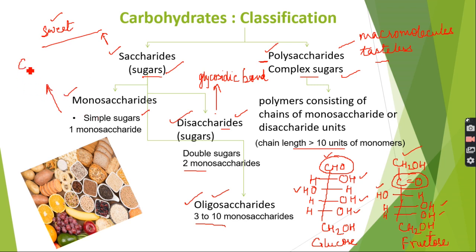For monosaccharides, the samples available are glucose and I think fructose, maybe galactose also. All these are examples of monosaccharide molecules, a single unit of carbohydrate.